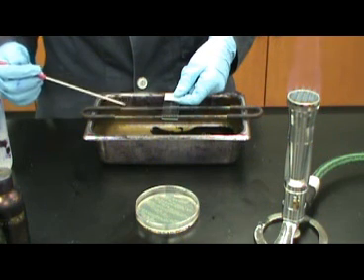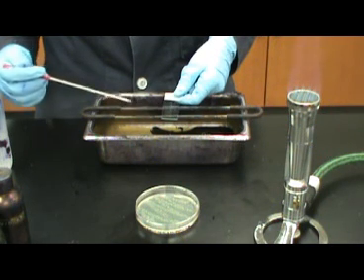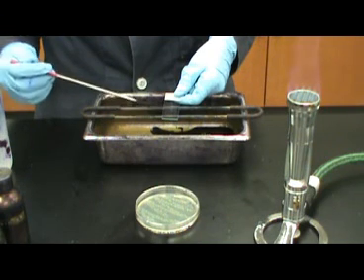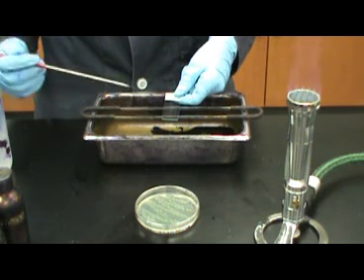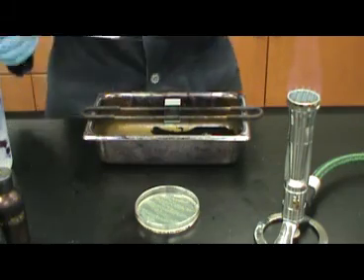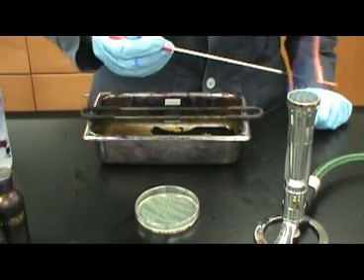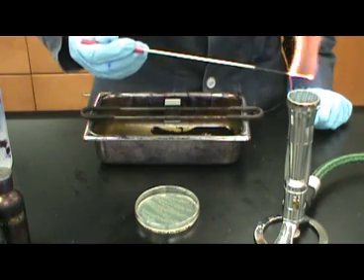Once you have added a small loopful of water to your slide, you can then aseptically obtain whatever bacteria it is you are trying to stain. Carefully mix the bacteria with the water and cover the entire slide with the mix. You want the cells to be in as much of a single layer as possible. This allows the best observation of size, morphology, and arrangement. Once you have completed the slide, allow it to sit to air dry.